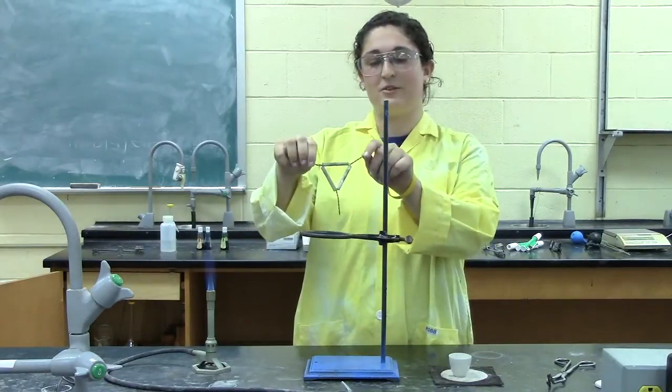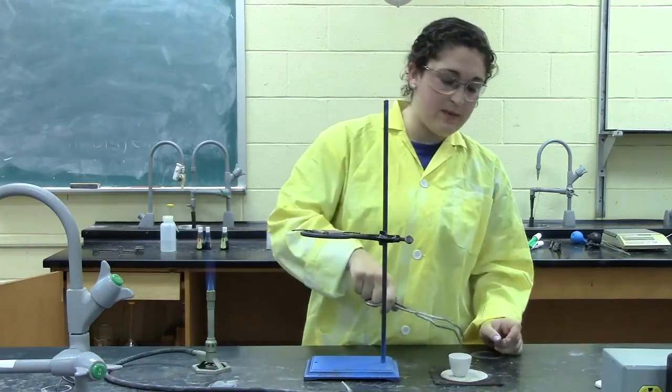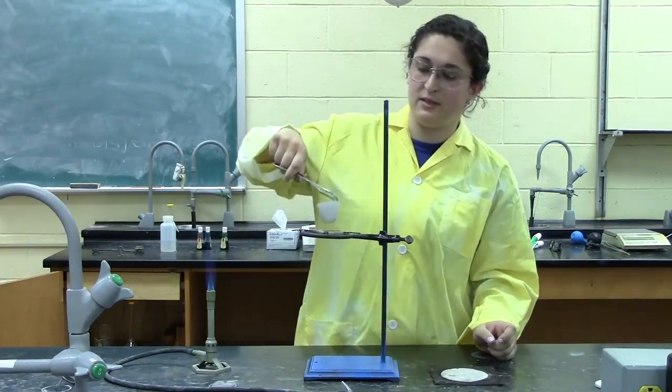You place the clay triangle on top of the ring, and then pick up your crucible with your tongs and place it on to dry.